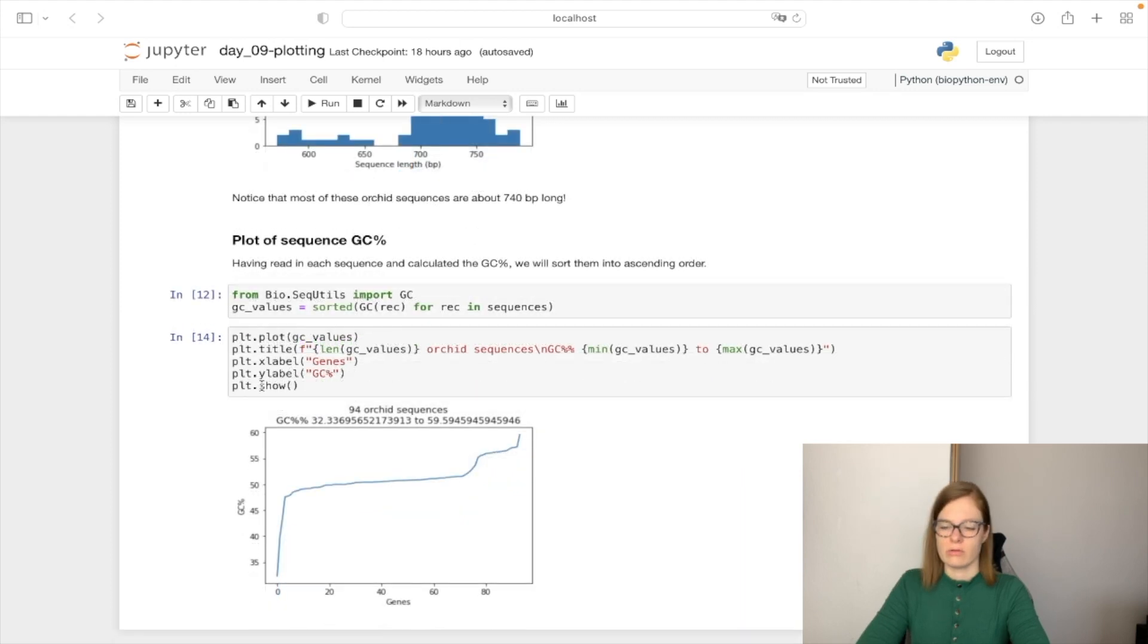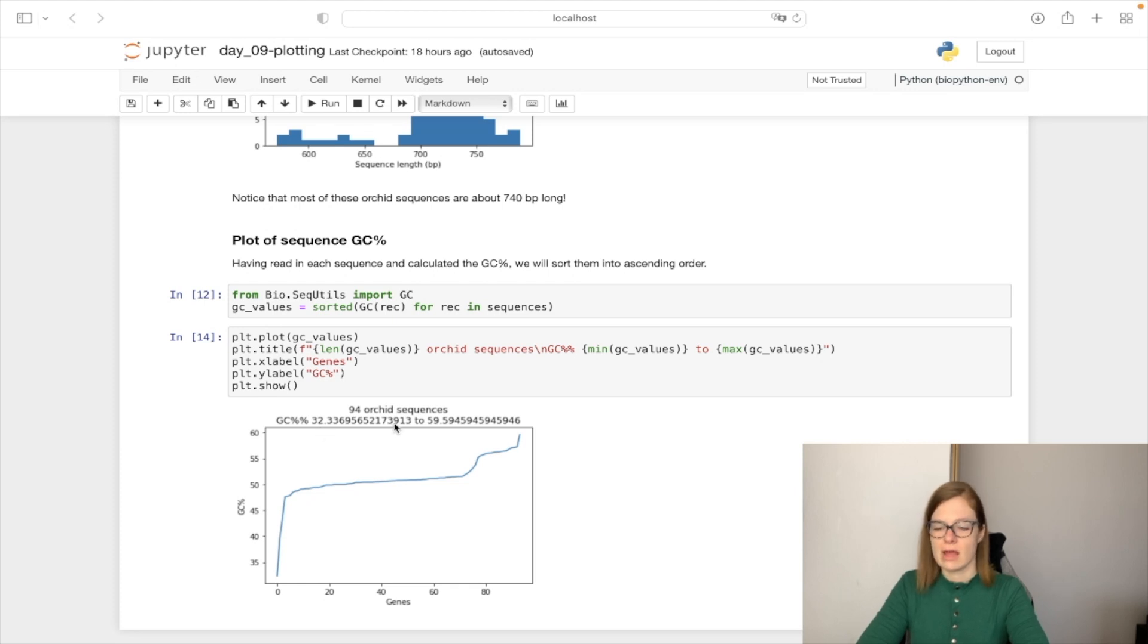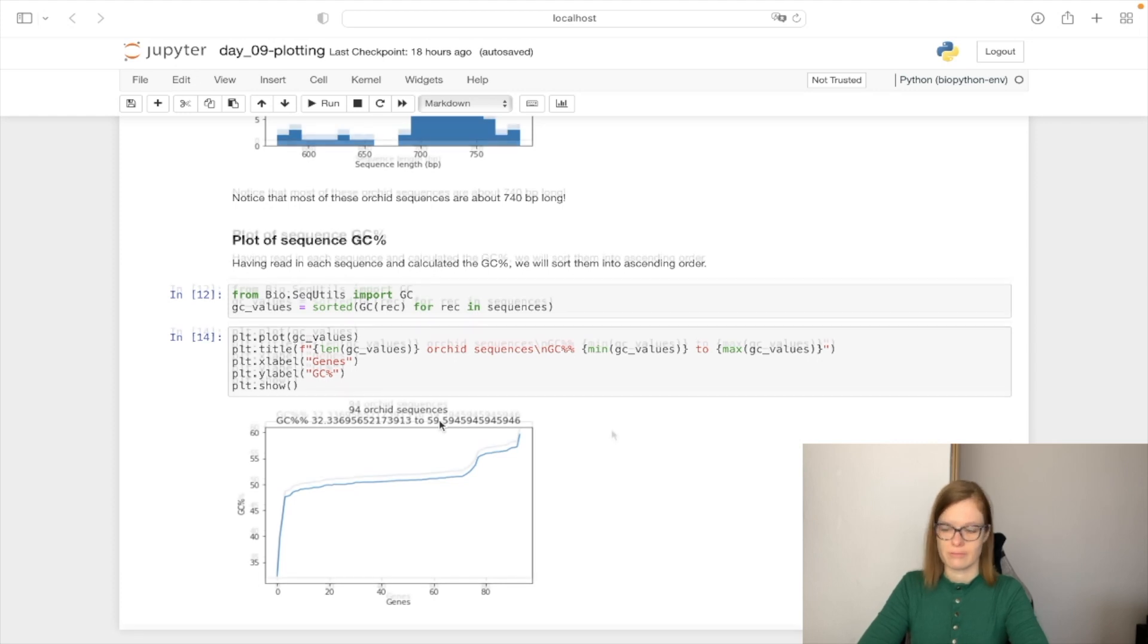We are going to use the plot.show to do the plot. And we can see that the GC content is between 32% and 59% for the sequences coming from Orchid genome.